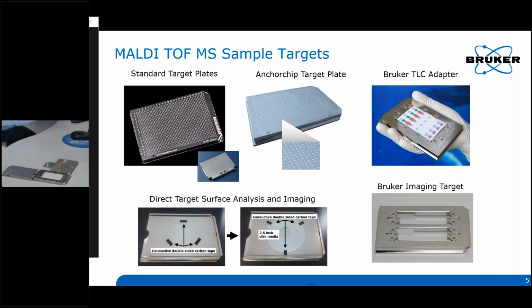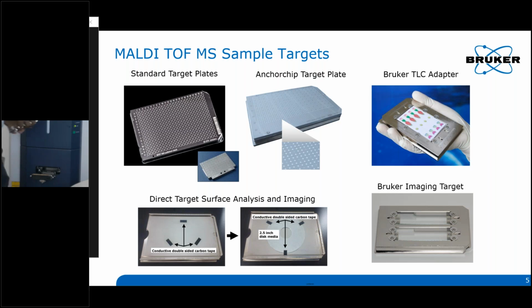So I'm going to go ahead and introduce this into the instrument while we look at the other targets. Basically, when you're done preparing your sample, you just put your target in and then hit inject. Inject and eject, in and out, just like you would a CD on a computer.